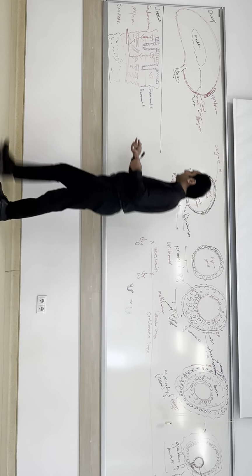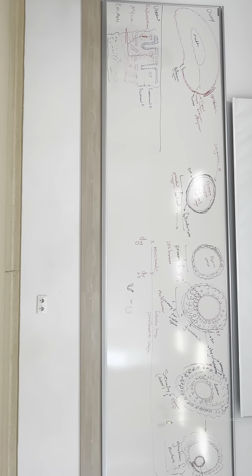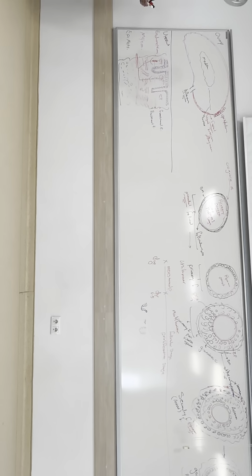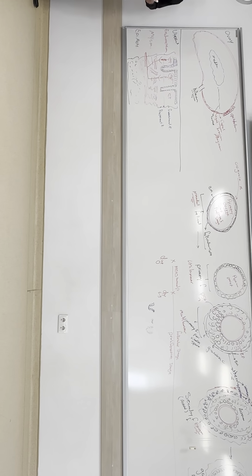But we need this basement part to return the functional surface of epithelium.